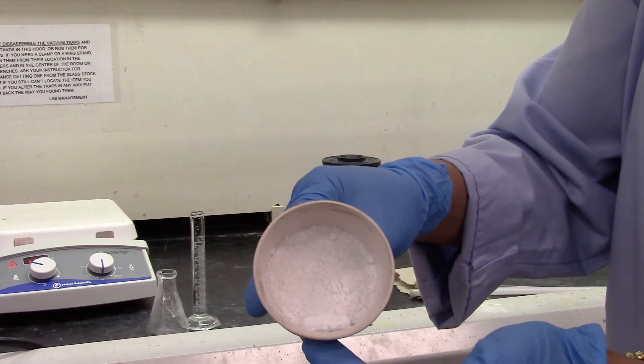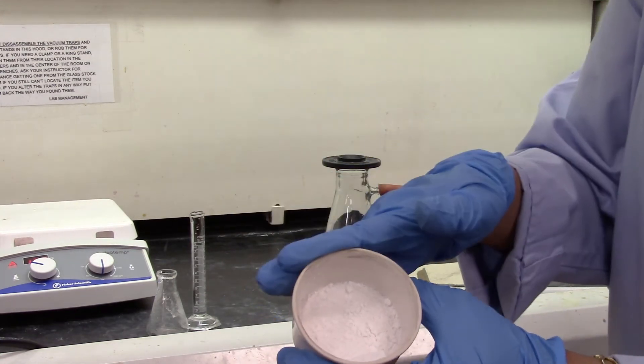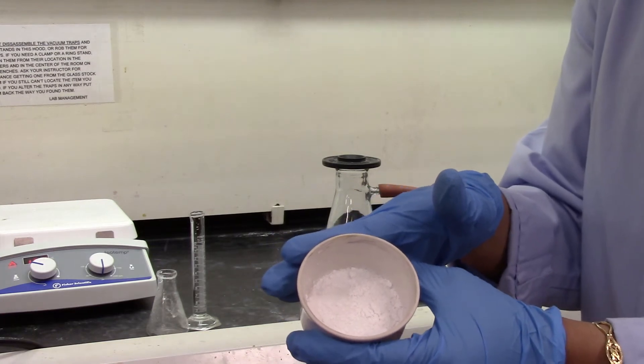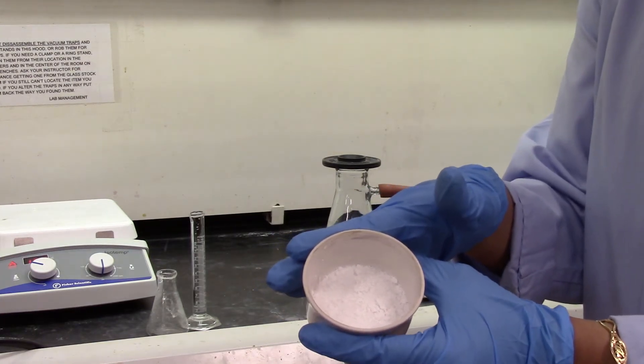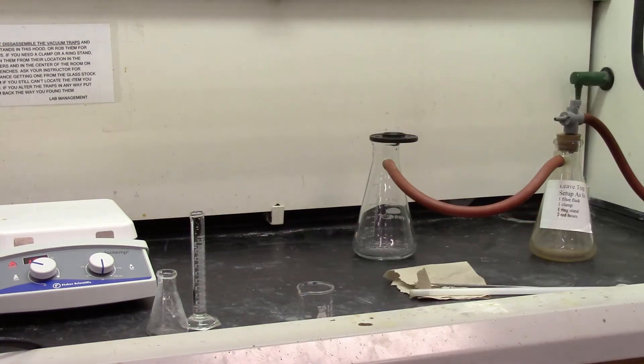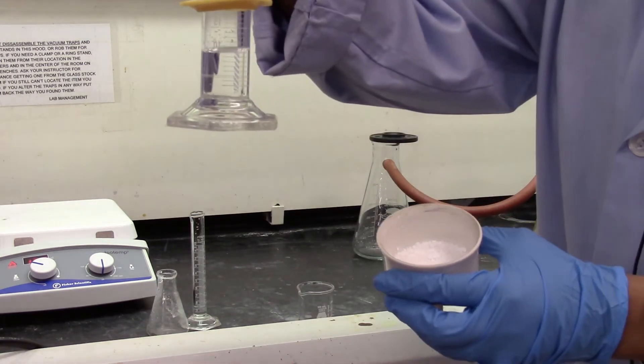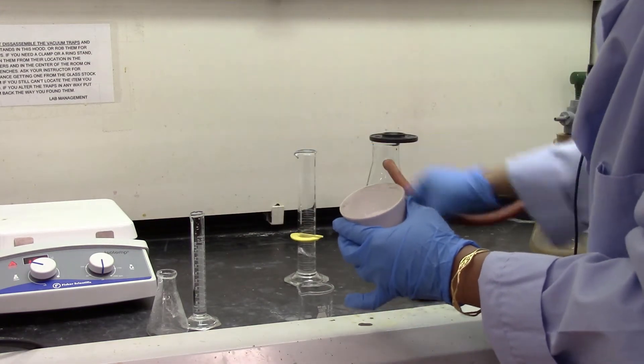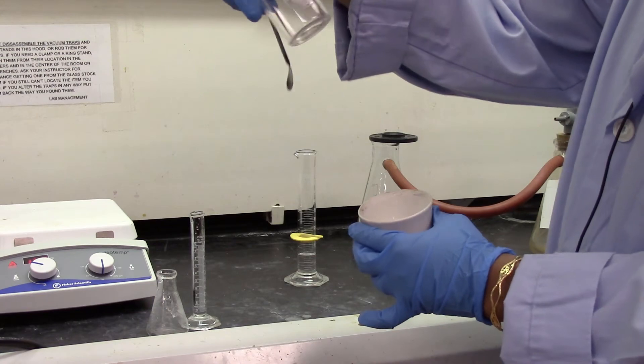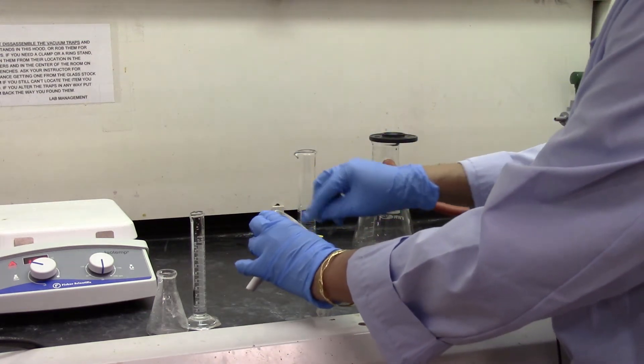And I still have the stir bar. I got to take it out. And I'm going to transfer this using about 10 ml of dichloromethane or methylene chloride. So here's my dichloromethane. And instead of an Erlenmeyer flask I am using a beaker. It's a 50 ml beaker. I'm going to transfer all my product in here.